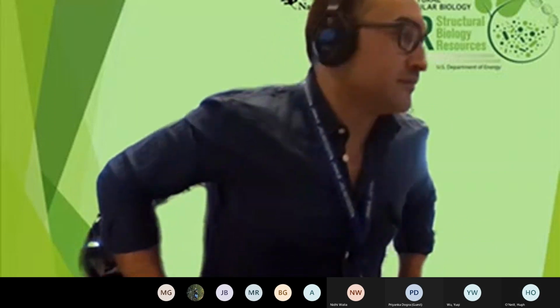Okay, it's time to be back. So now we can go over the process that I was talking about during my presentation. I posted in the chat some SANS data for those persons that don't have their own data.